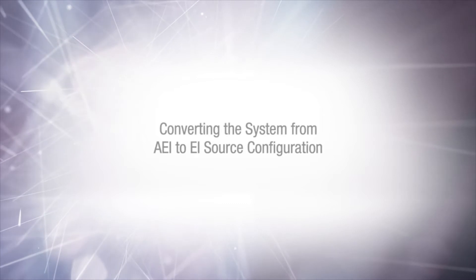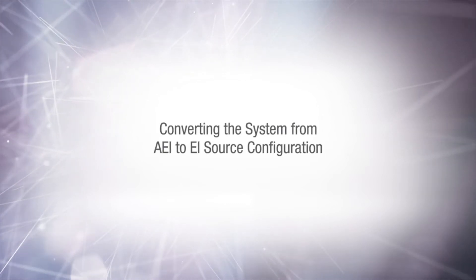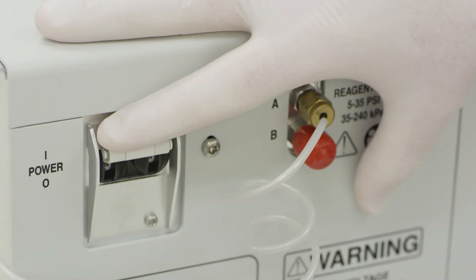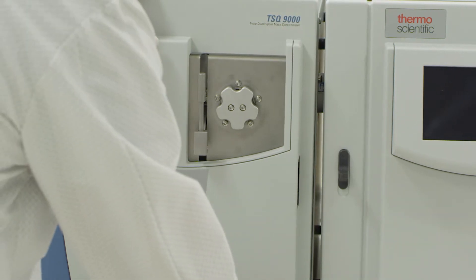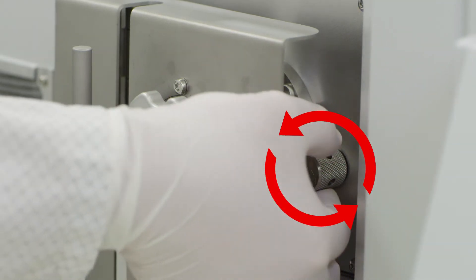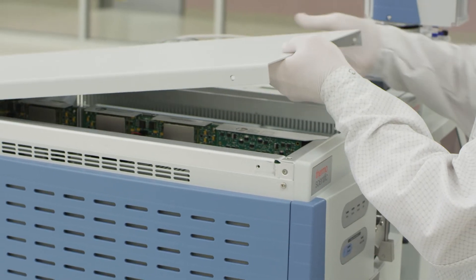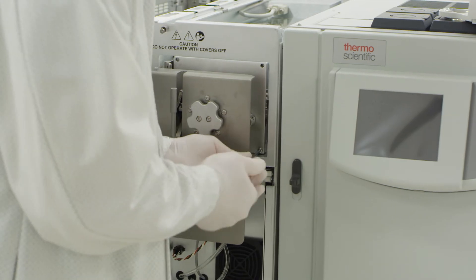In this portion of the video, we will be converting the system from AEI to EI source configuration. To begin, shut the system down. Open the front cover to access the manifold. Open the manual vent to relieve the pressure of the vacuum, and use the previous instructions to remove the top cover and manifold door screws.